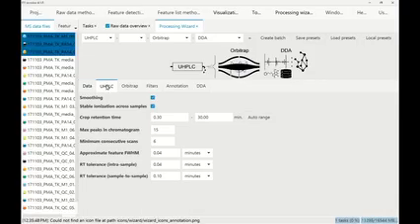Then we did UHPLC, and I'm not going to describe all the optimization of the parameters too much here. We can maybe have that a little bit in the questions later, if you're interested. We also had done some workshops before, and there are some videos online where we had a whole day basically describing all the processing optimization. But for UHPLC, yeah, there are some questions here in front.